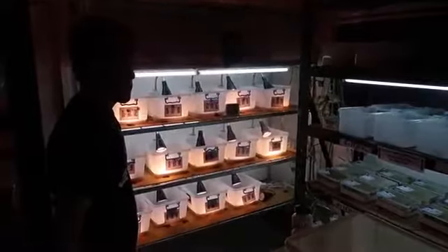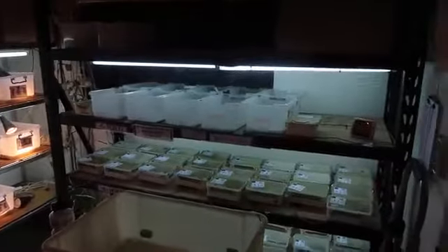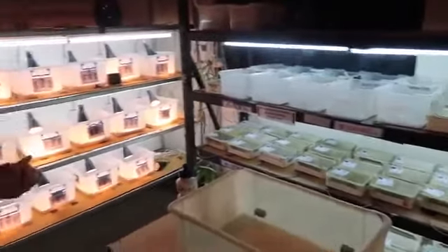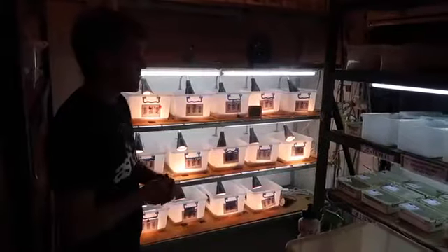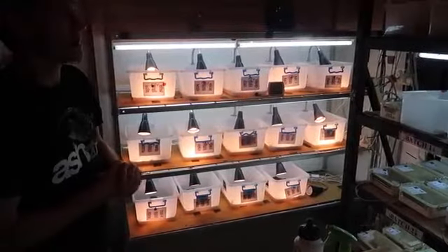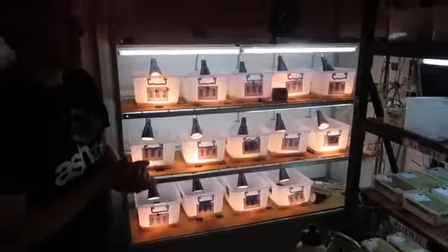So this is just another small room that we have in the Cognition Center. We've got racks where we can stack up quite large numbers of lizards, providing they're relatively small. Again, we've got more of the Lampropholis delicata here, the delicate skinks that Dan Noble and Fonty Carr are currently working on. But in the past we've had geckos and tree skinks and all kinds of things. It's quite useful having a number of these small rooms where we can keep large numbers of lizards for behavioral experiments.